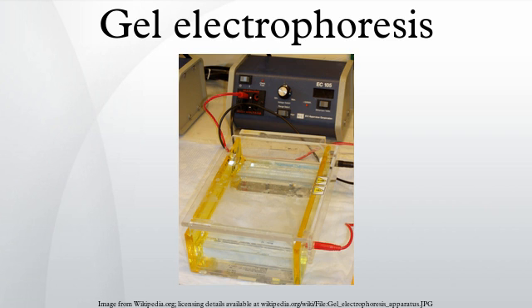The gel is placed in an electrophoresis chamber, which is then connected to a power source. When the electric current is applied, the larger molecules move more slowly through the gel while the smaller molecules move faster. The different-sized molecules form distinct bands on the gel. The term gel in this instance refers to the matrix used to contain, then separate the target molecules. In most cases, the gel is a cross-linked polymer whose composition and porosity is chosen based on the specific weight and composition of the target to be analyzed.